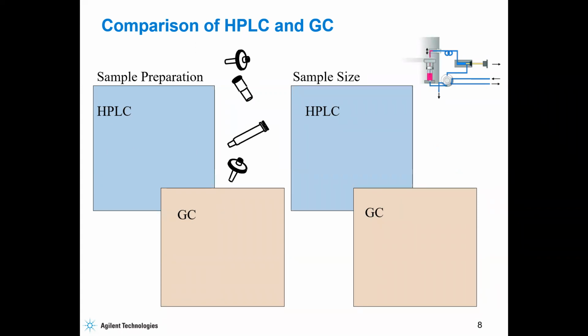I have a question, but it's actually on detectors. We were talking about detectors today, and I remember that in our class on GC, gas chromatography, we also talked about detectors. One of the characteristics mentioned was non-destructive of sample.